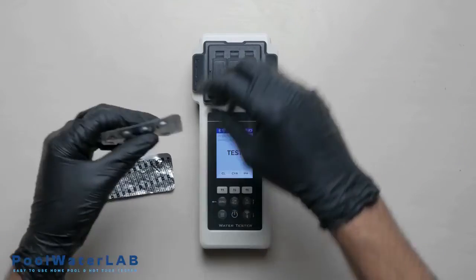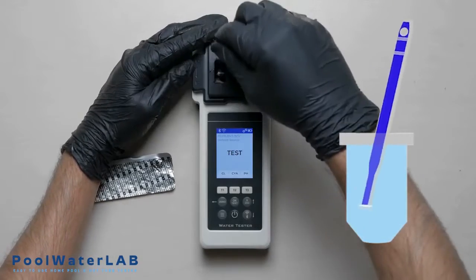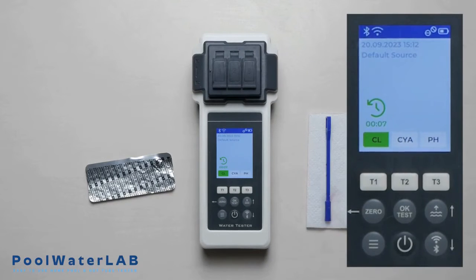In this case, add the tablet of DPD number 1 into chamber number 1. Crush and stir the tablet with a special stirring stick. Cover the measuring chamber and press the one button, then press OK.